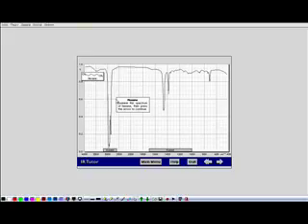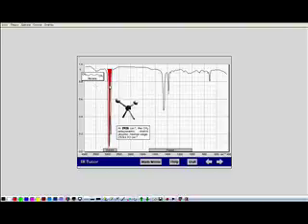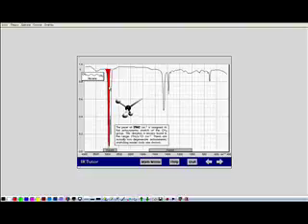You can see that for hexane and basically for any of the alkanes, it's a pretty boring spectrum. There's only a few intense peaks. And remember, the peaks are upside down in our spectrum. But these types of frequencies turn out to be different types of stretching and bending motions. So one of them is an asymmetric stretch of a CH2. Or then there is a symmetric version of this, or that's an asymmetric stretch of a CH3 group. The key thing is that for an alkane, sp3 carbon-hydrogen bonds all show stretching just below 3,000 wave numbers.